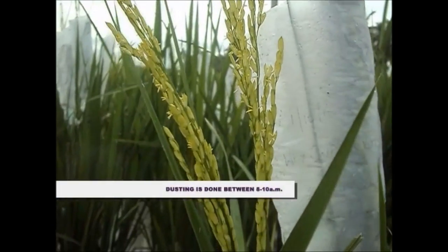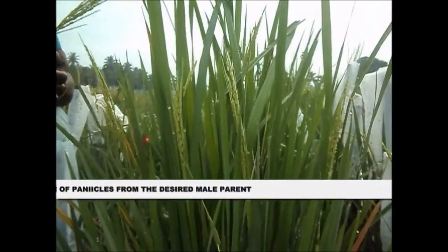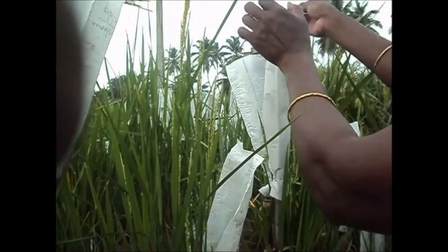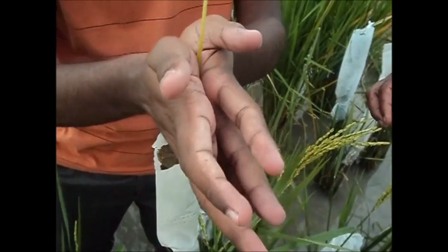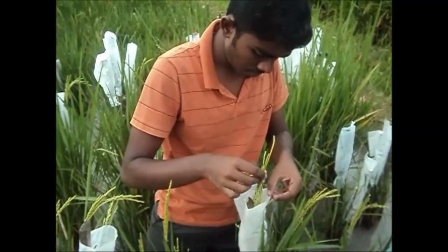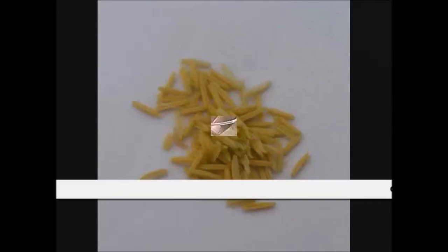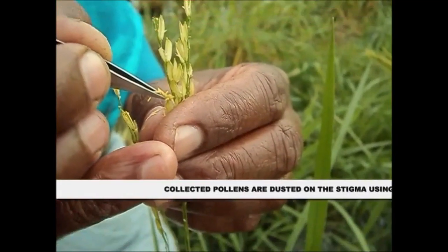Dusting is done between 8 and 10 am. Collection of panicles from the desired male parent. The male parent panicle is inserted in an inverted position into a paper bag and turned in both directions in order to disperse the pollen onto the emasculated spikelets. In another method, the pollen grains are collected in a petri dish and used for dusting. Collected pollen are dusted on the stigma using forceps.